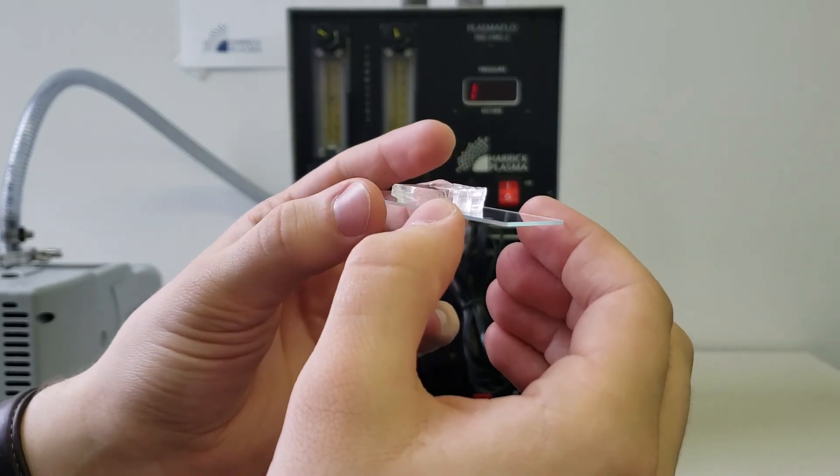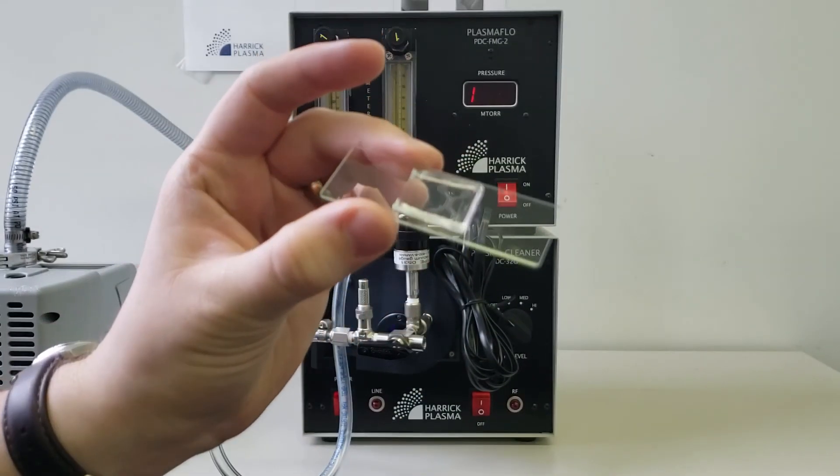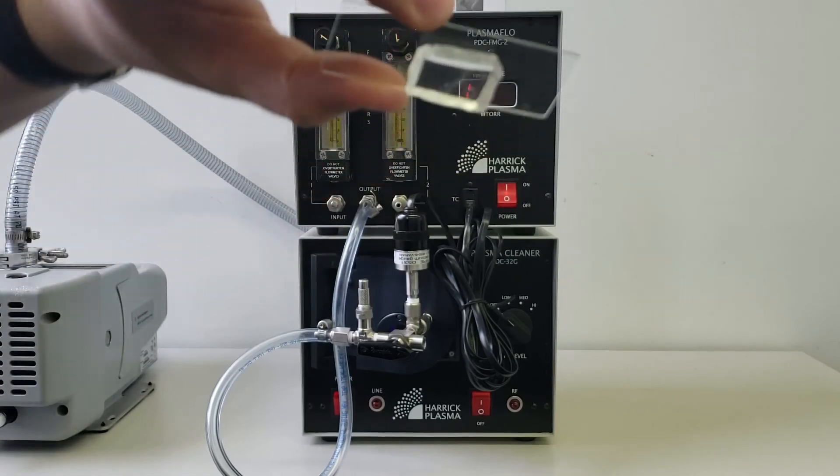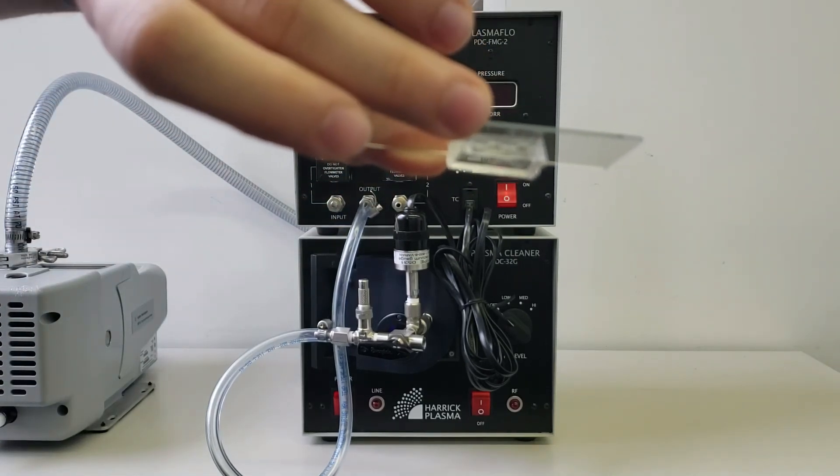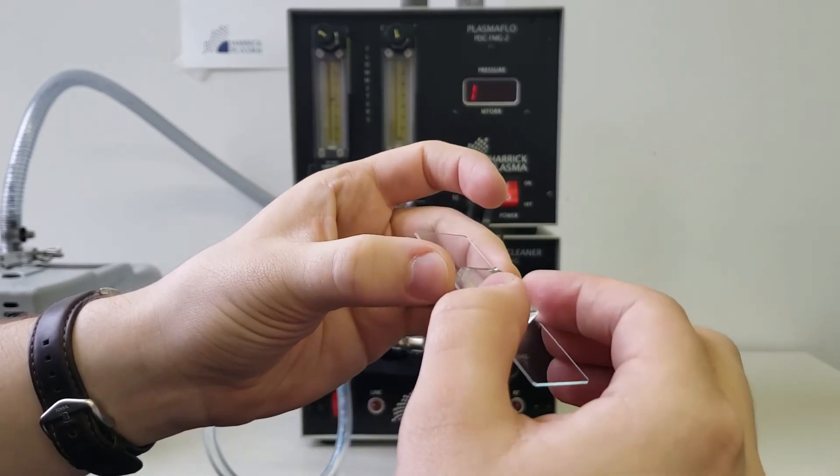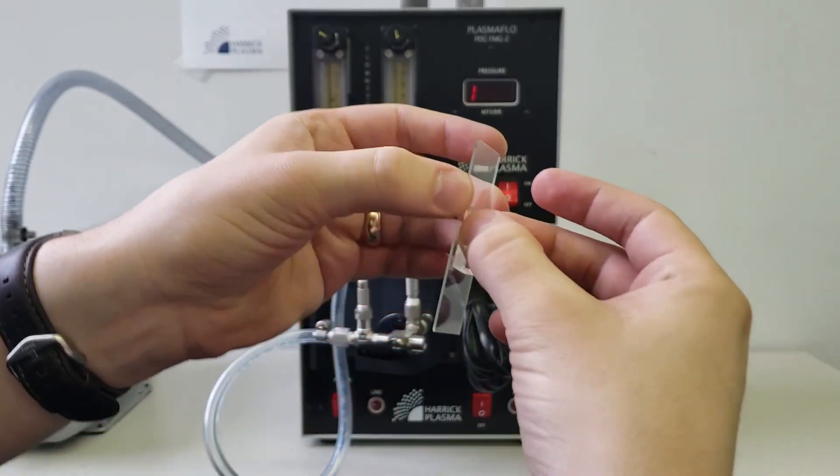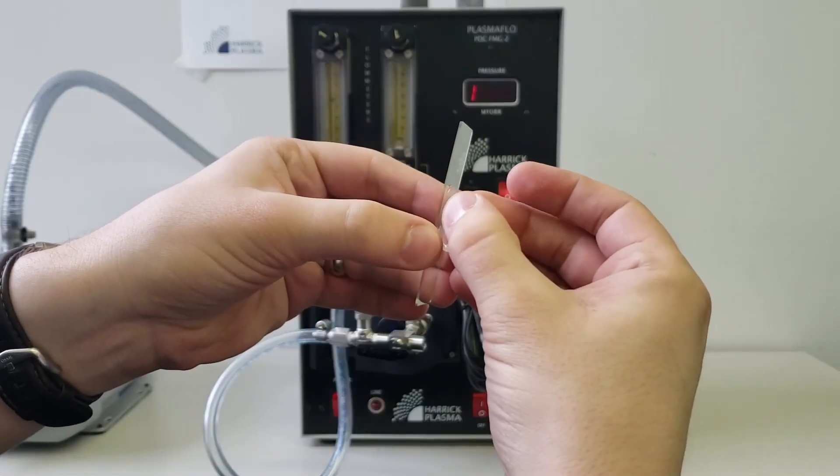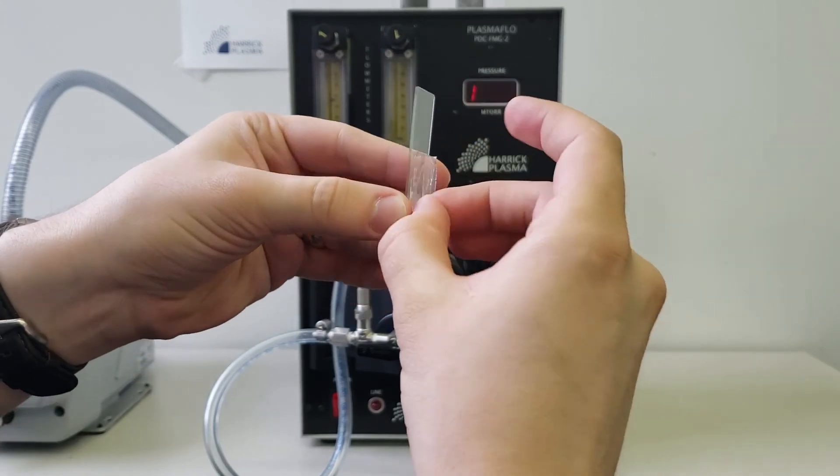The increased surface energy produced by plasma treatment tends to reconfigure to a more energetically favorable, lower energy state over time in hydrophobic materials like PDMS. We recommend bonding and any subsequent processes be performed within 15 minutes to an hour of plasma treatment time.